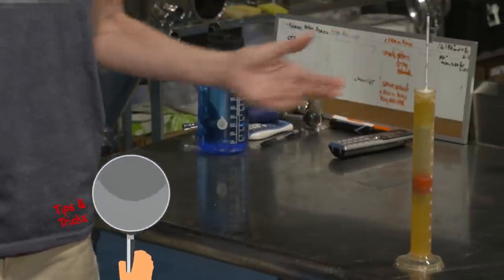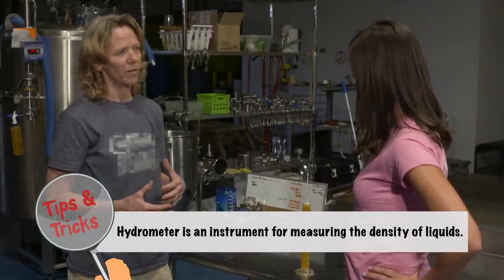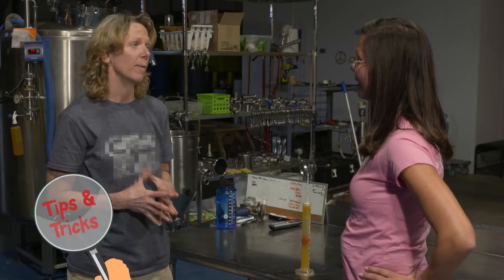As this floats, it gives us an estimate of how much alcohol is in this volume. And we can use that to figure out precise alcohol by volume in the batch of beer.